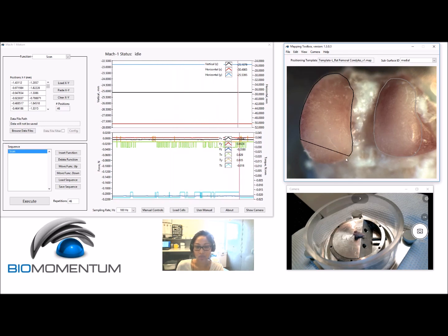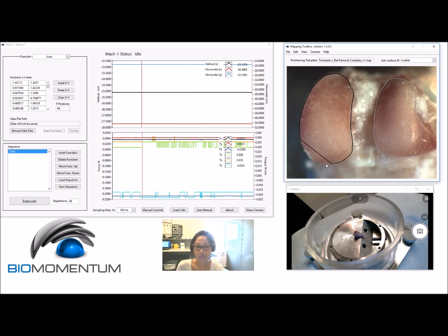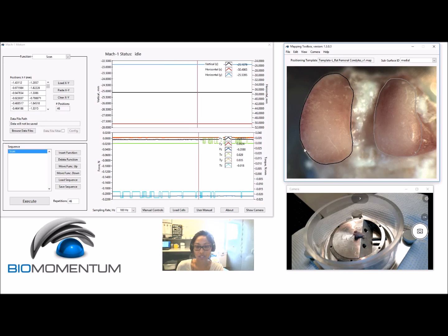This step is important for the interpolation of characterization values to the boundary to obtain a complete mapping of the sample surface.